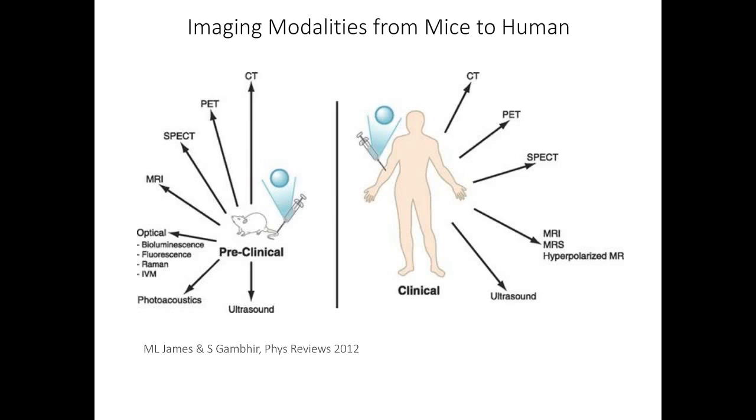For the most part, all of them can be, even though on this slide it shows that certain ones like optical are not necessarily translatable. Nowadays, that's not necessarily true. You do have some surgery, for example, that does implement optical imaging, and Nick Bernthal, who's going to be speaking next, may be able to give more insight into how that translation works.